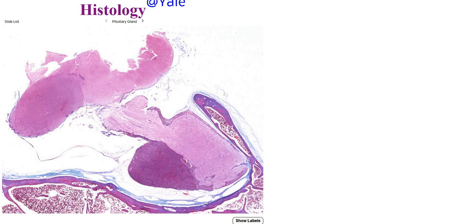First histology we are going to look at in Lab 18 is the hypothalamus. And for this lab, I highly recommend checking out those histology resources. Right now we're looking at the Histology at Yale University resource, but the Human Protein Atlas also has some really good examples that we'll look at today.